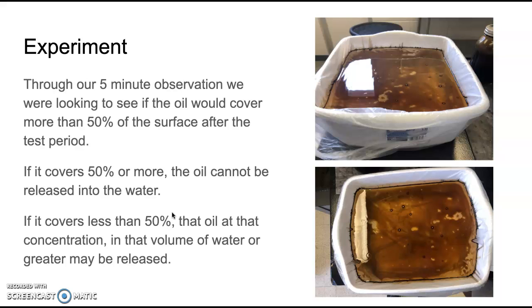Usually in the real world, this would be a little bit longer, maybe a couple of hours, something like that. Through our 5-minute observation, we were looking to see if the oil would cover more than 50% of the surface after the test period. So our test period here would be 5 minutes. So we want to see if the oil covered more than 50% or less than 50%.